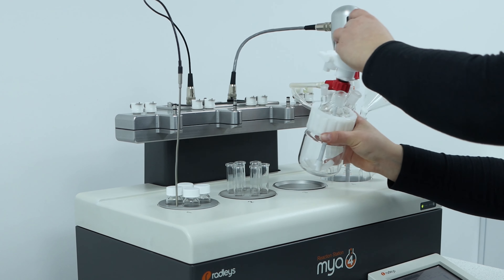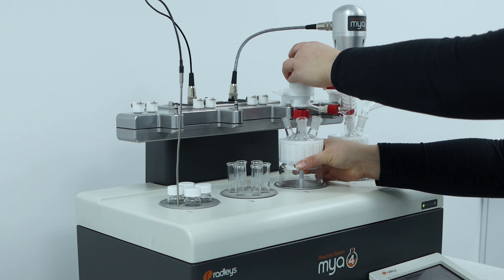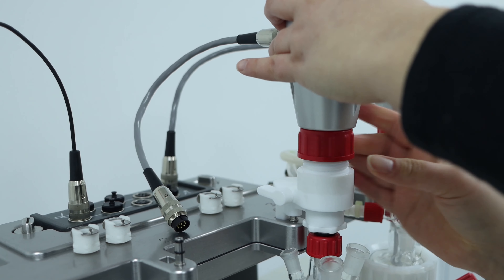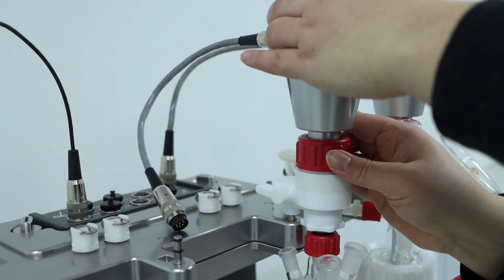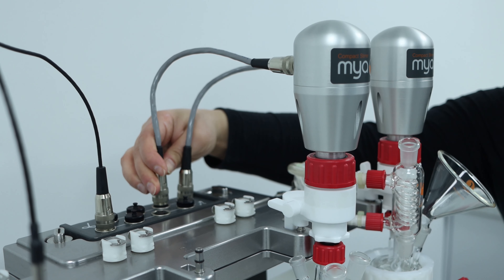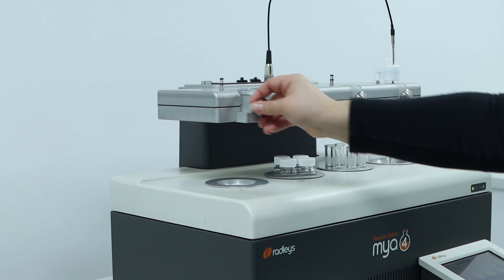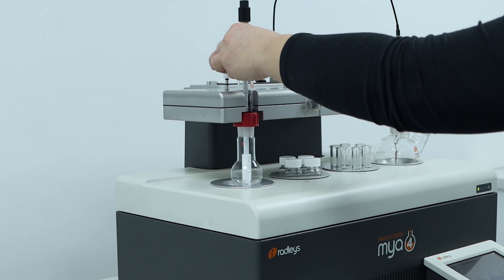Overhead stirring can be difficult and time-consuming to set up on small-scale reactions. However, on the Maya 4 reaction station, adding an overhead stirrer is quick and easy. You can also use overhead stirring when using a reflux head.